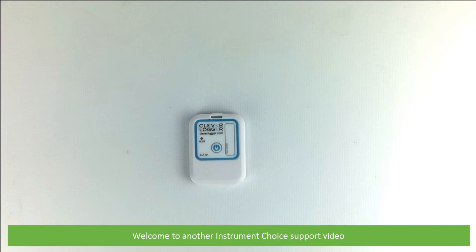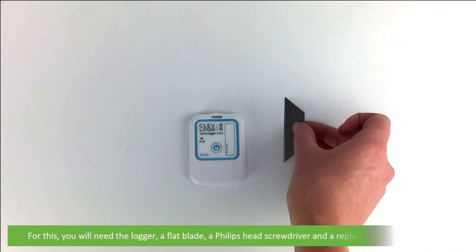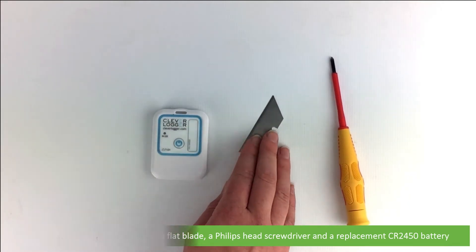Hi and welcome to another Instrument Choice support video. In this video we'll show you how to change the battery in a clever logger. For this you will need the logger, a flat blade, a phillips head screwdriver and a replacement CR2450 battery.